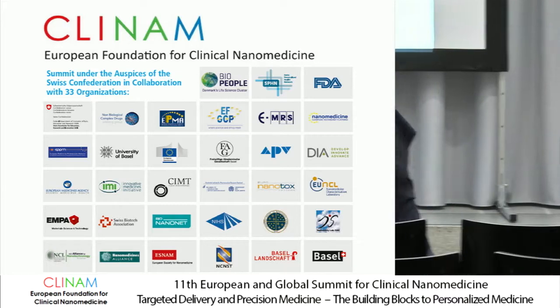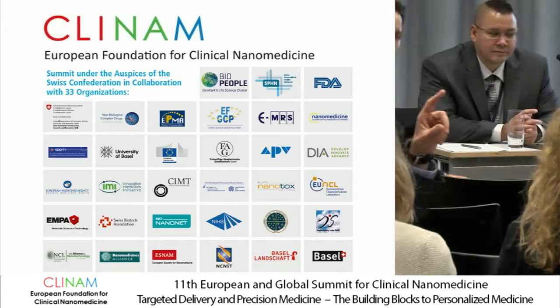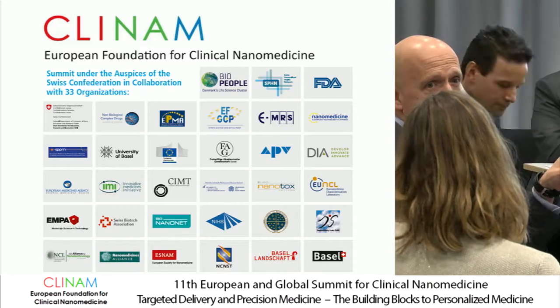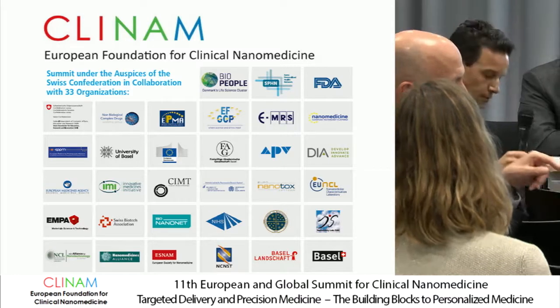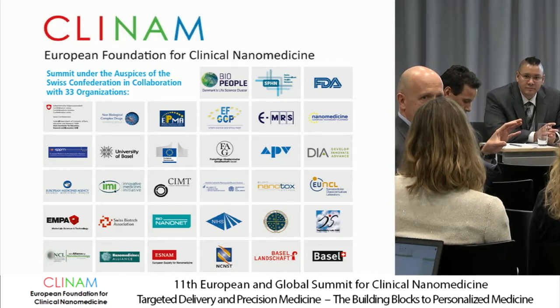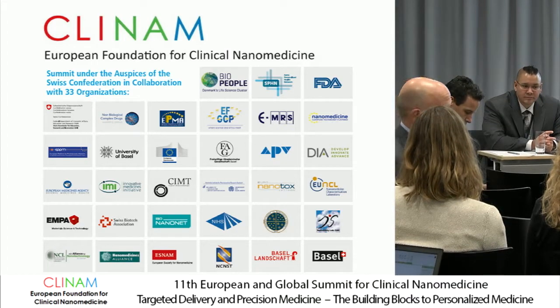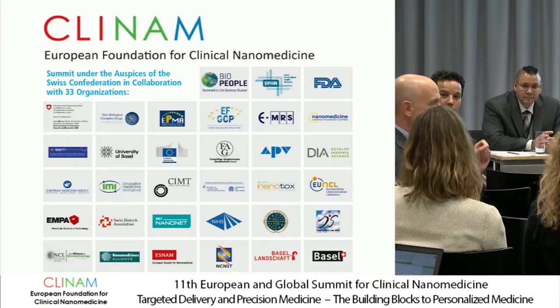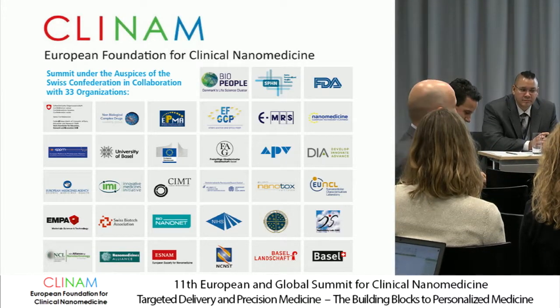I found your comment really interesting. Then I can tell a couple of points where EUNCL already can help and hopefully will help more in the future. What Fanny was referring to, we have published our SOPs for how to measure DLS, and they are public on our website. And the NTA, sorry, yes, I forgot about that.